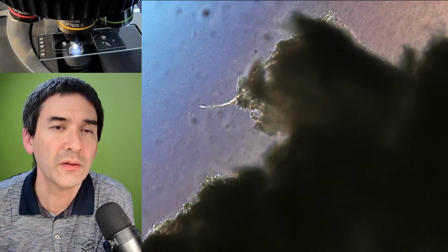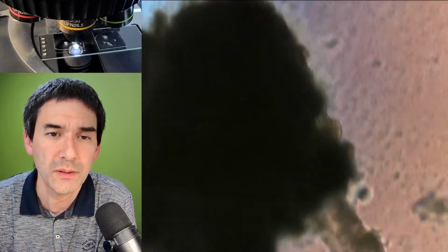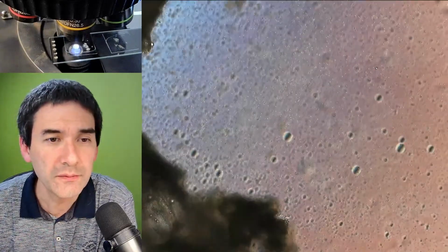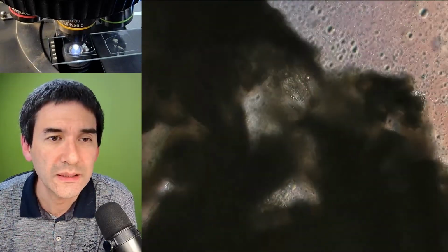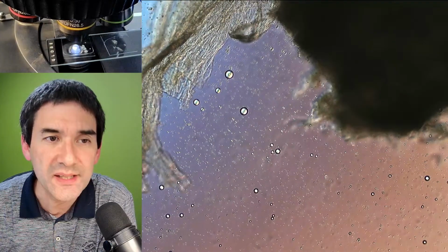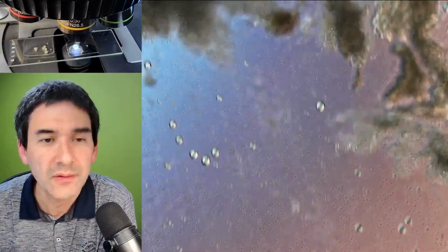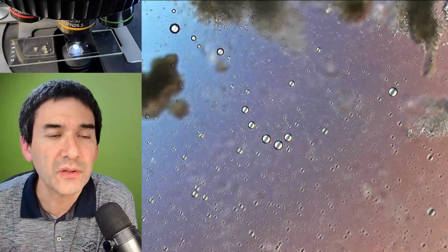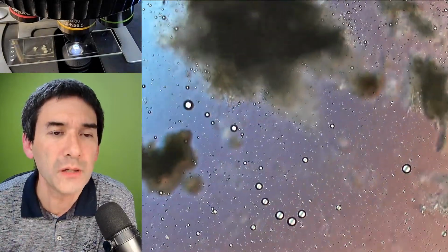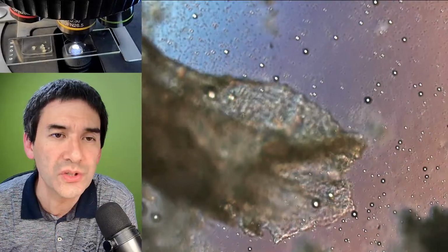Again, here in the back, maybe those string-like structures could be something. Let's move over here a little bit. See, the problem with this sample is it's simply too dense, so let's try the other one. Those things here could be either air bubbles or oil droplets, but I do not think oil droplets because of the alcohol.